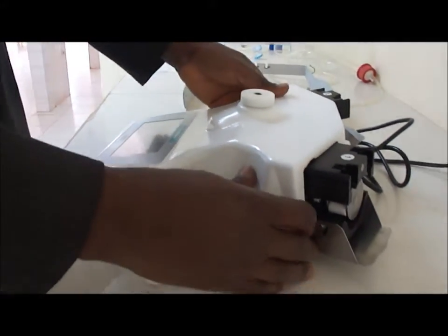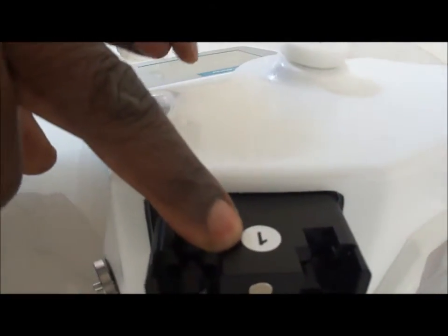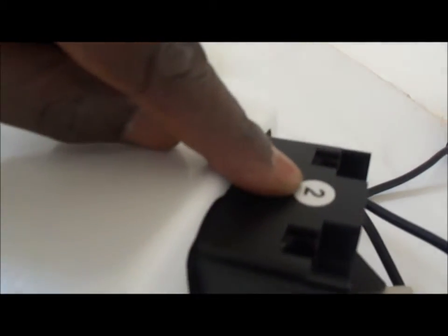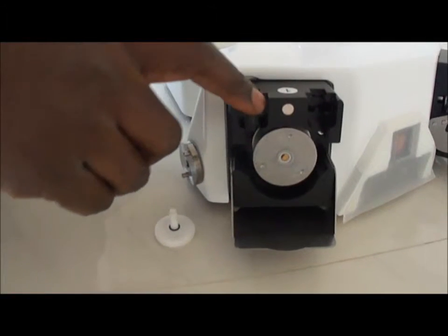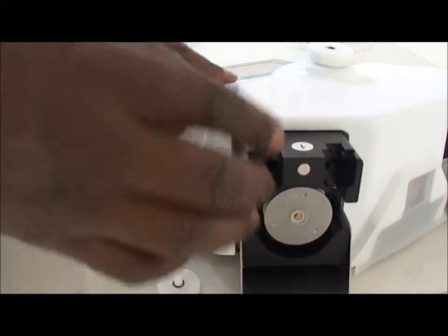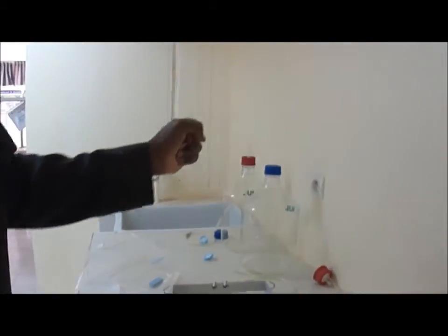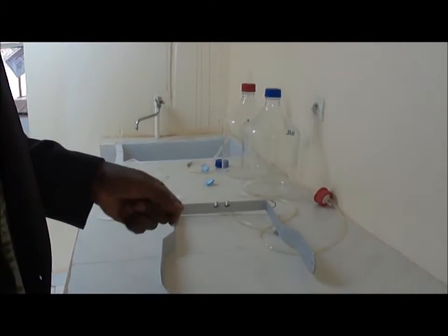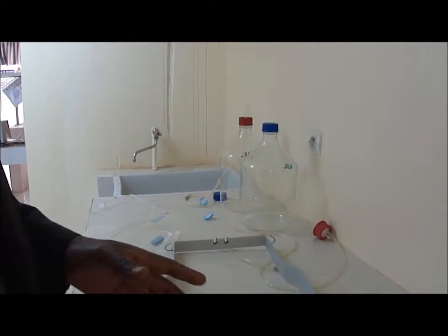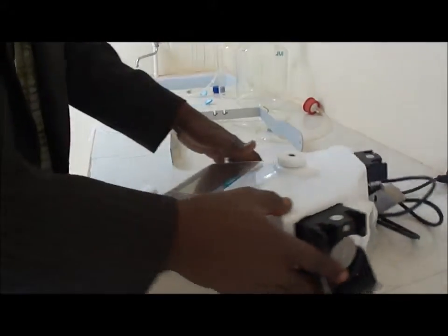In fact, the central device itself has two pumps. You have pump number one here and pump number two here. These pumps, in a few minutes you will see, we will mount a pipe here from the bottles that you have already seen, and the pump will pump water from the diluent bottles, and bring this diluent to mix it with the sample. And the frame, we will mount it on this system.